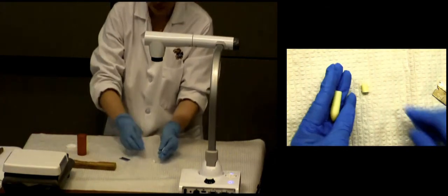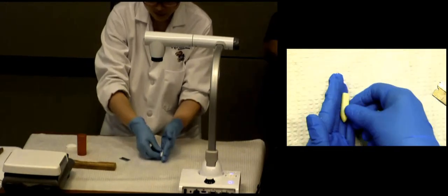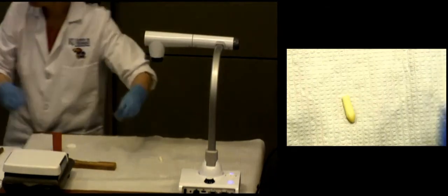It does have a little dent in it. Can you see that little dent on the tip part of it? And that's why, again, being careful and selecting ones that don't have it on there matters, because they come out dented if they start dented. So what would you do with that final suppository?